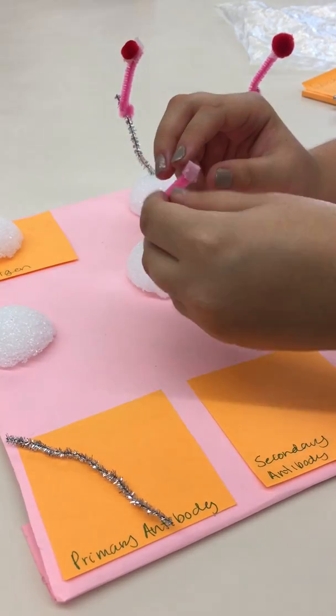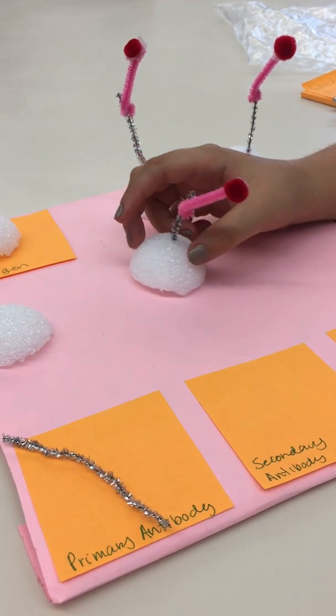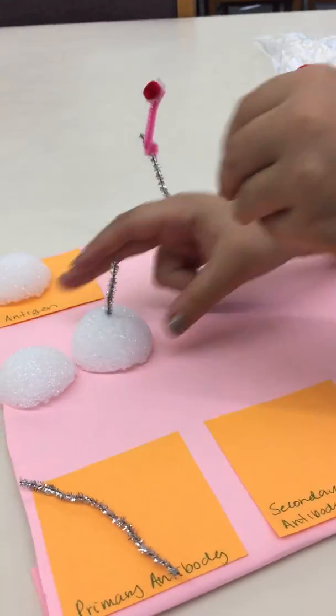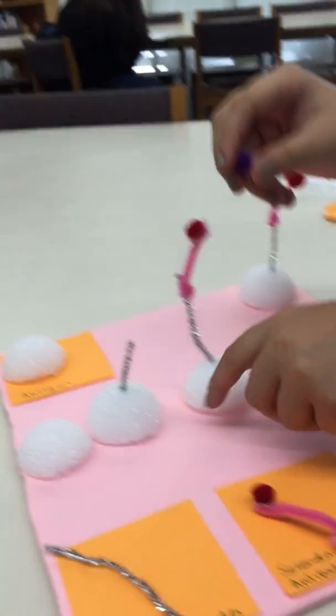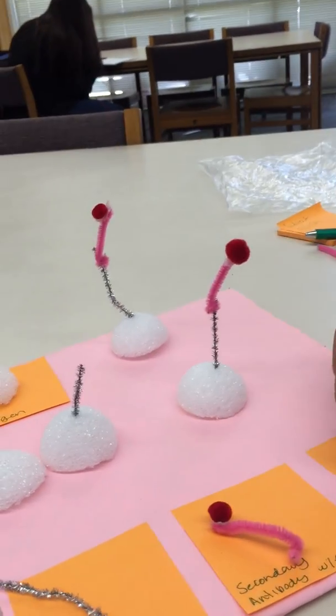one of the benefits of an indirect ELISA is that it matches to a whole bunch of them. And then you wash away the rest, which takes you to the next step, in which substrates are washed in and will cause a reaction, which gives you your result.